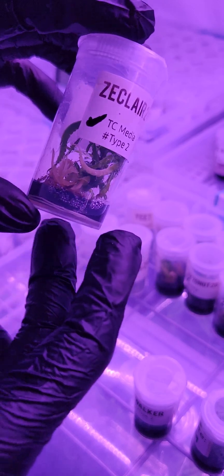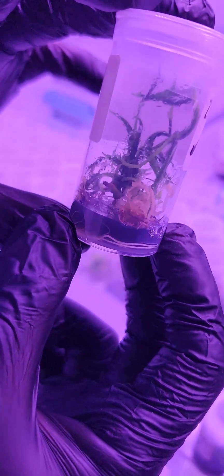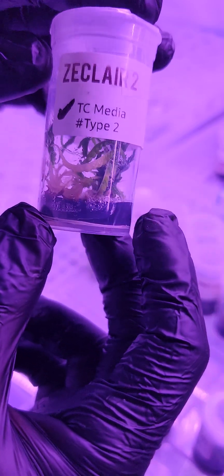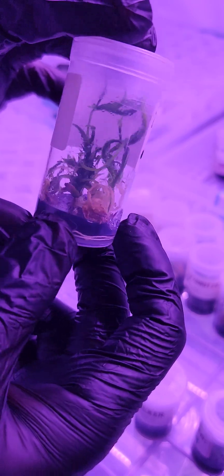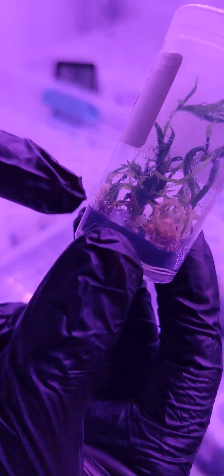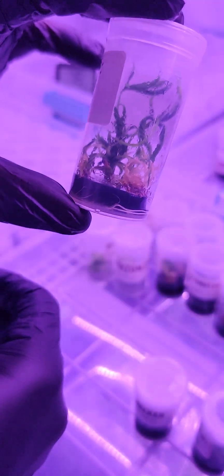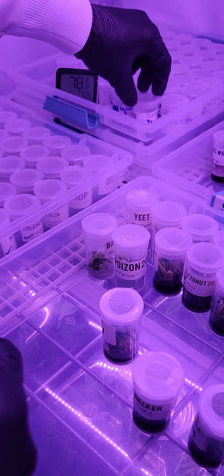Z Claire, which has a lot of OG in it, is obviously a big fan of Type 2. Now this is multiplication media, not rooting media, but what's interesting is Z Claire really wants to root and did create roots in Type 2. The unfortunate part is that this is a Stage 1 culture, meaning this plant came from a plant that was just growing in normal conditions.